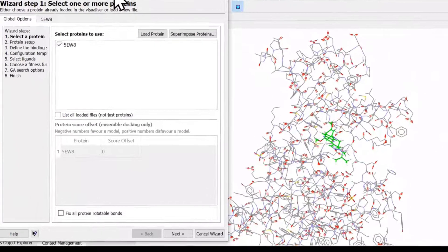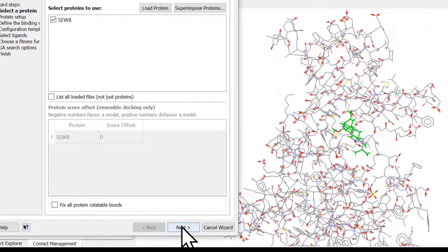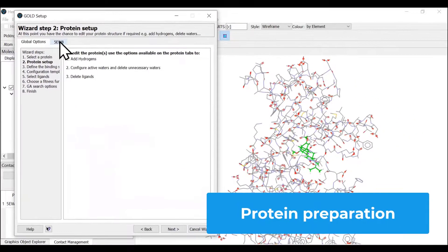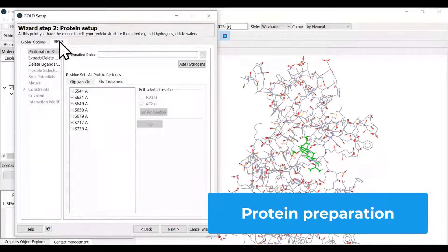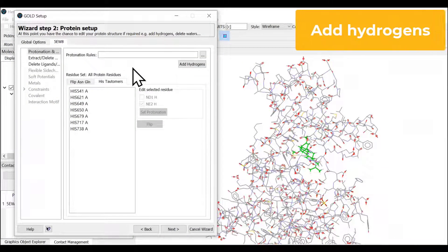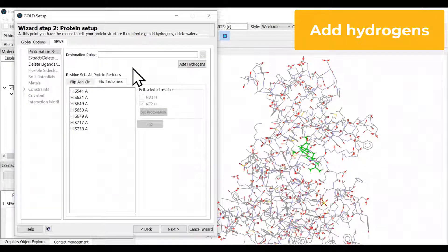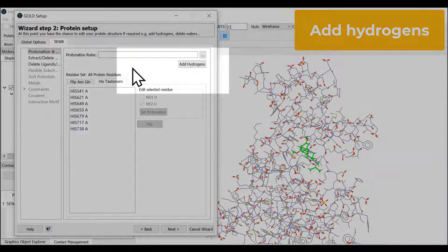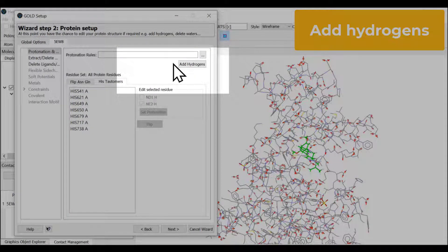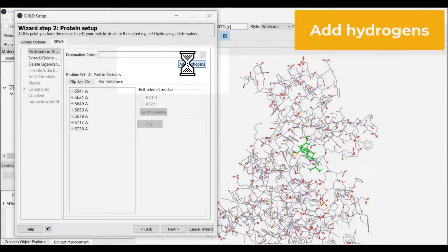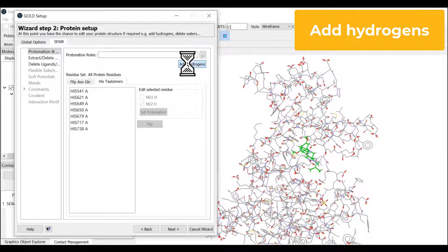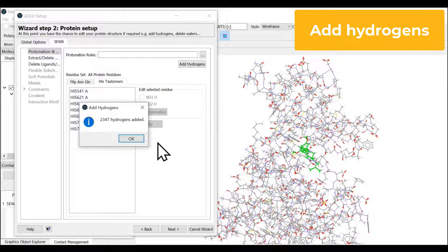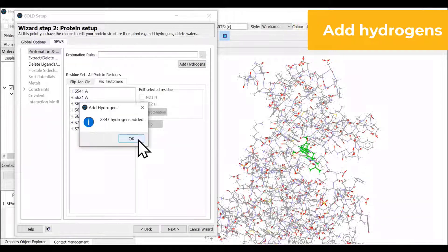The next step is to prepare the protein itself. There might be some missing hydrogens during the solvation of this crystal structure. We're going to add any missing hydrogens from the structure, and it has added 2347 hydrogens.